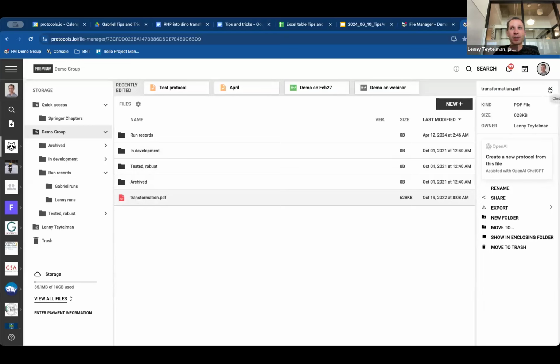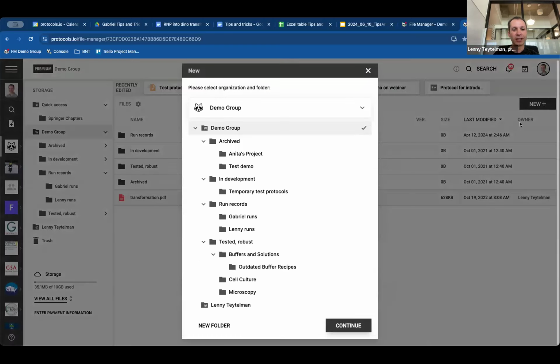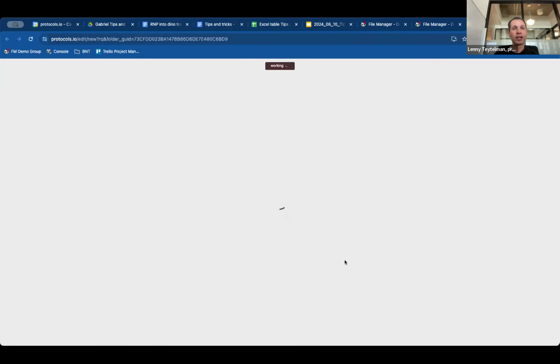If you have an extra minute for existing protocols, what we recommend is, I'm just going to put it in the demo group, I'm creating a new protocol.